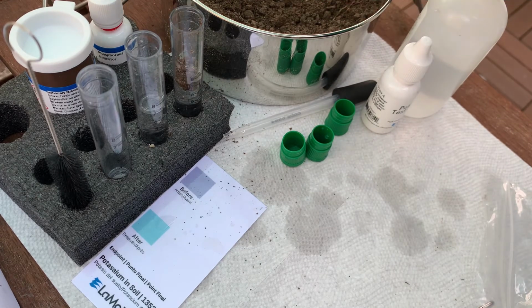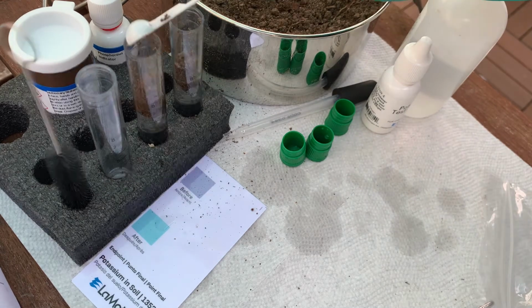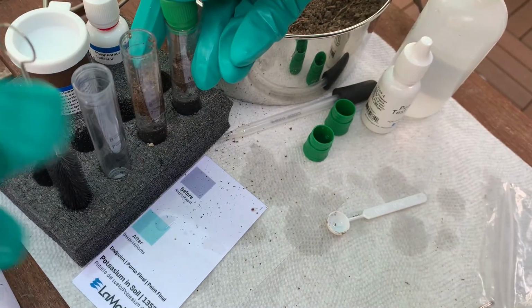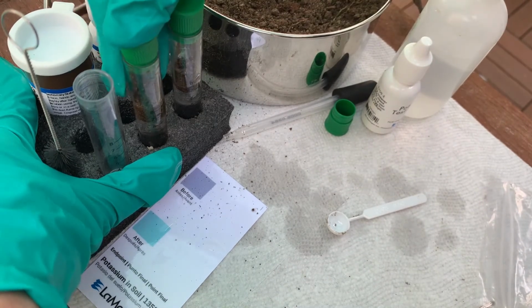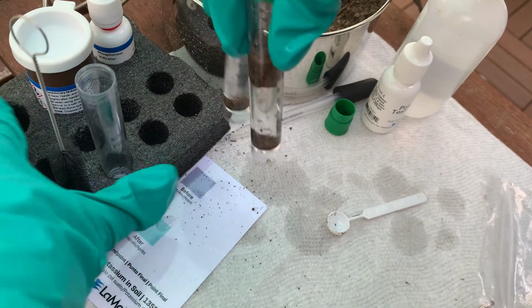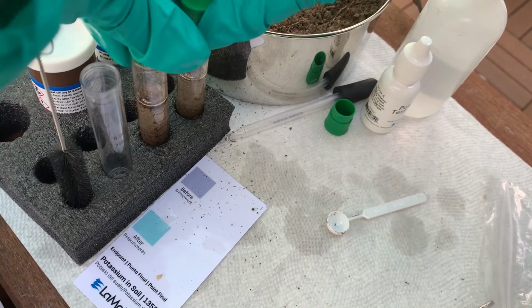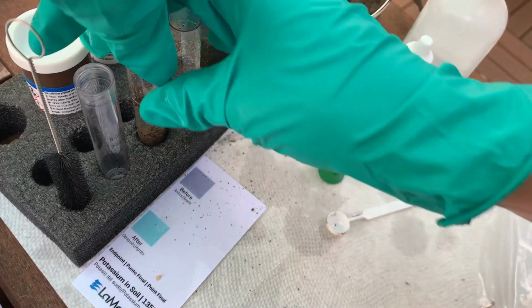So I'm filling 2 test tubes up to line 7 with potassium extracting solution. Then I'm adding 4 measures of soil to each of the test tubes. Now we cap these tubes and we're going to shake vigorously for 1 minute. Now we want to remove the caps and allow the soil to settle.